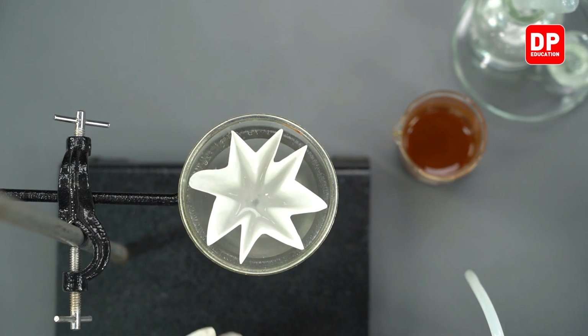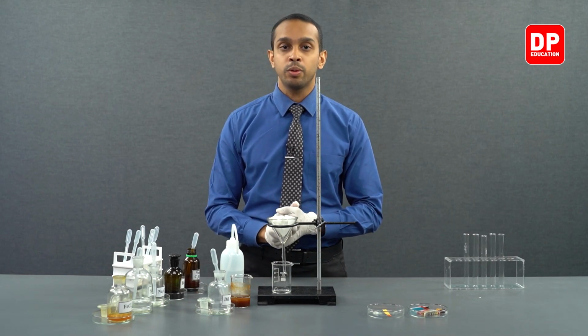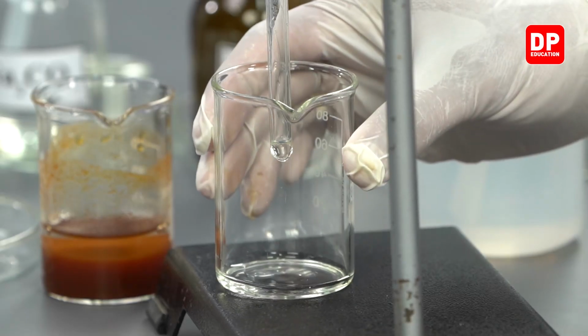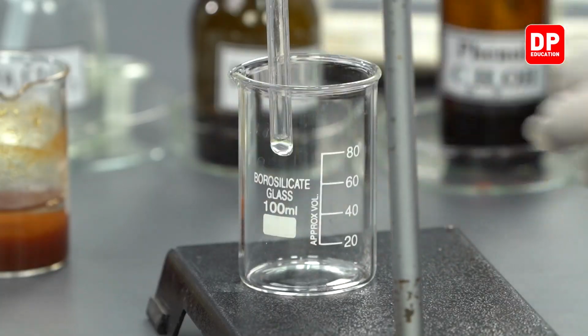This will fix the filter paper in place and will allow the filtering process to be a little bit more efficient.